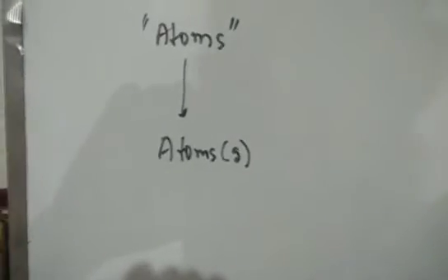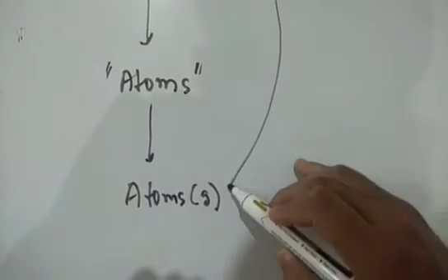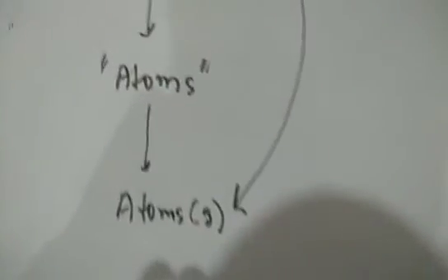Now this process of breaking the molecules into the free atoms is basically called atomization. So इस process के लिए, in order to make the atoms from the molecules, so what we do is that, so we have a process called atomization.